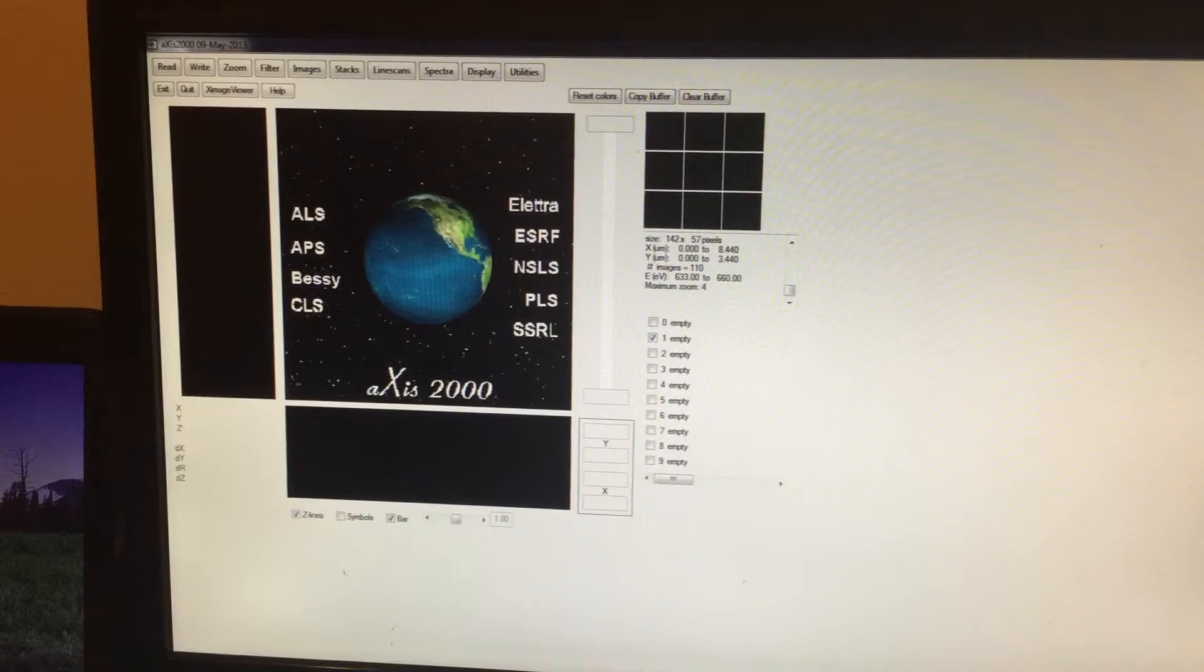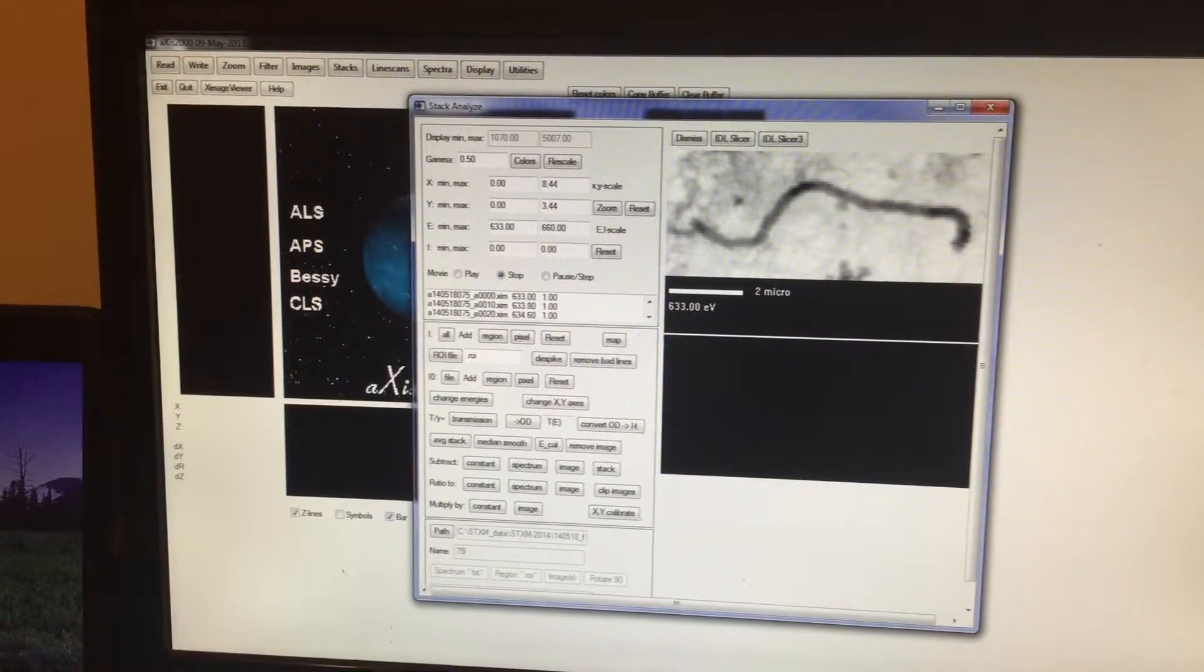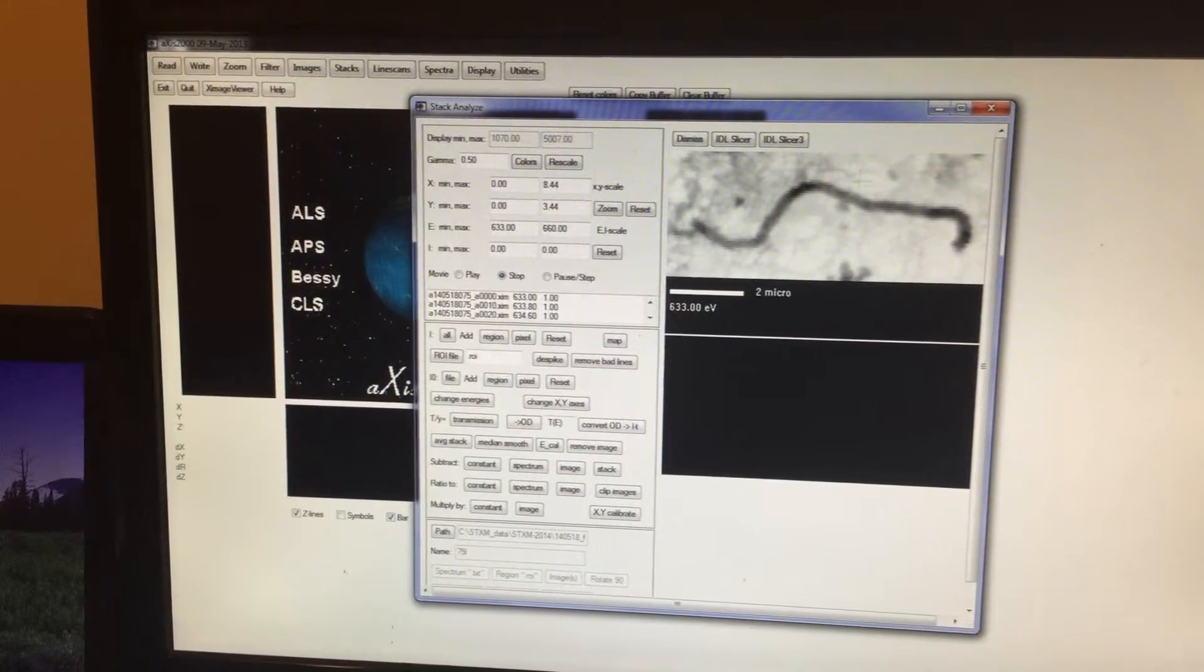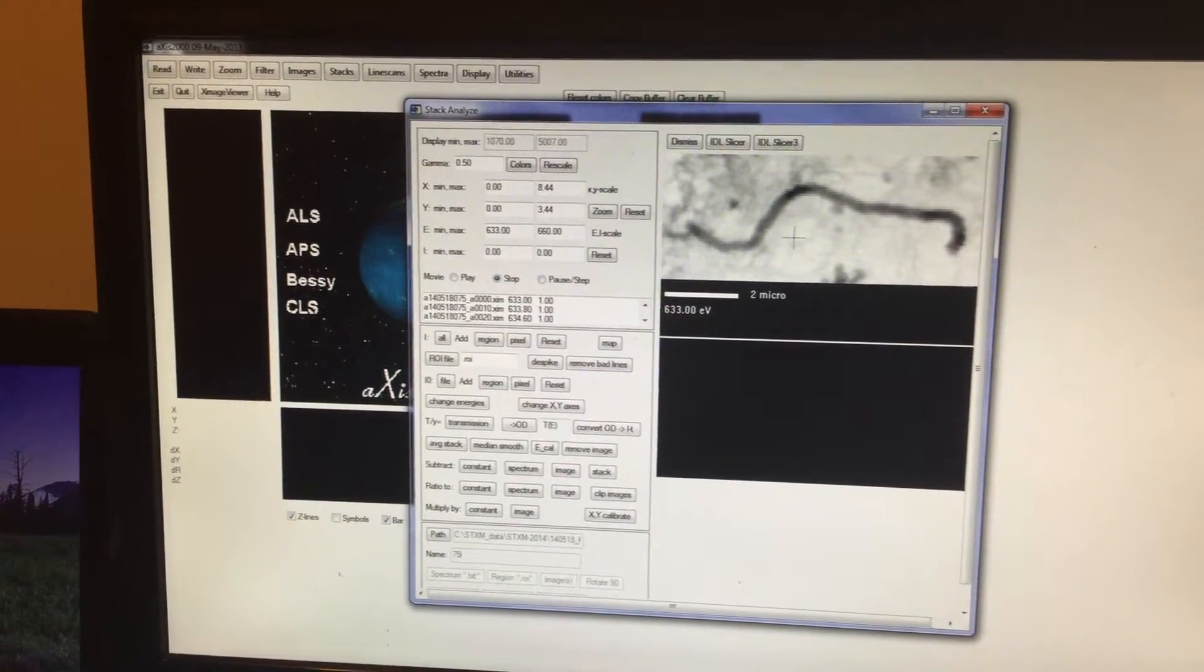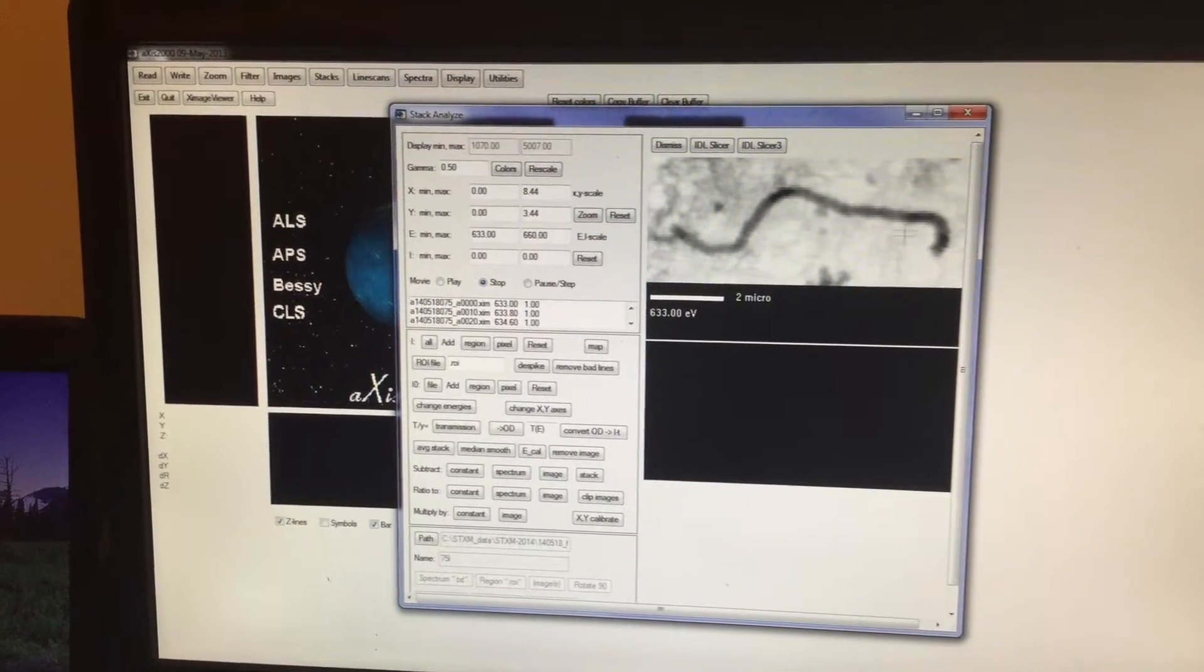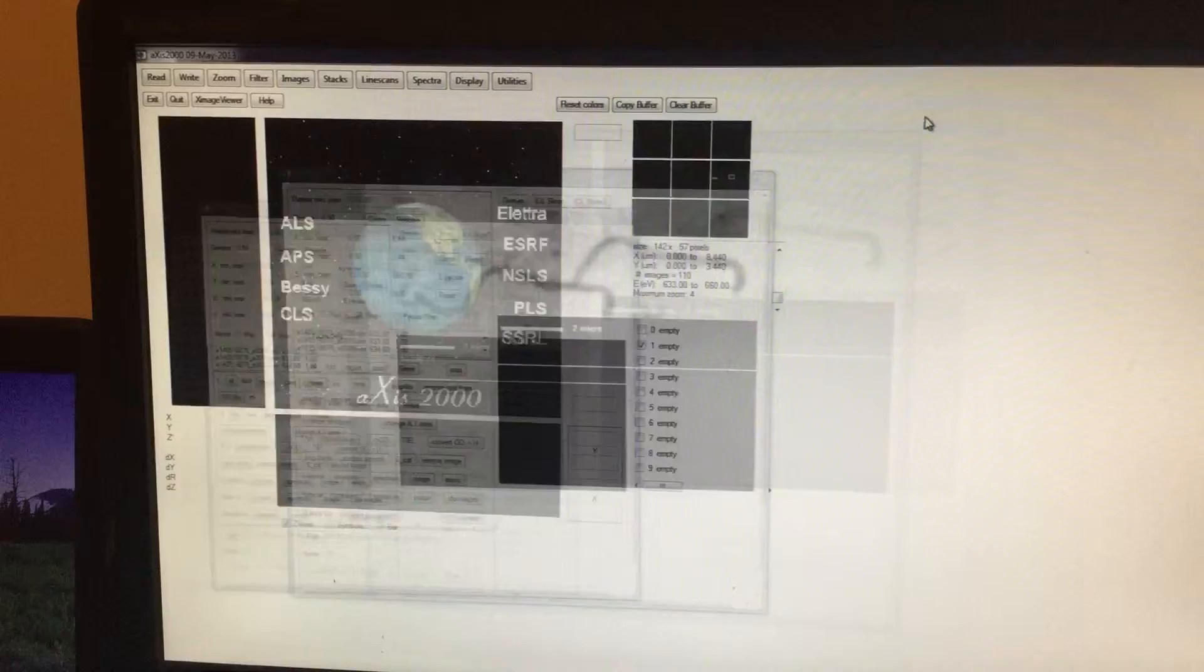This small window will open. Just click Enter, it will go away. And this is the stack corresponding to left circularly polarized light. You can see the nanowire STICSUM image. I'm going to minimize it.